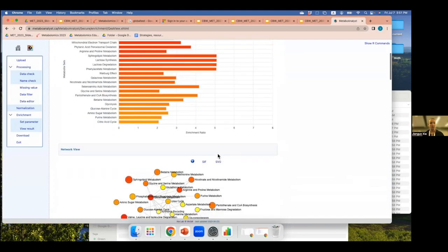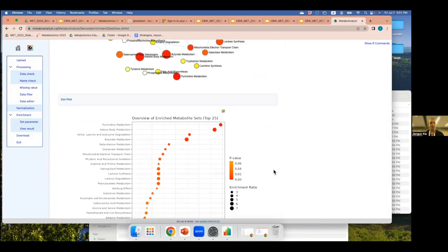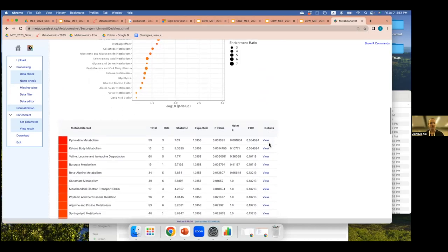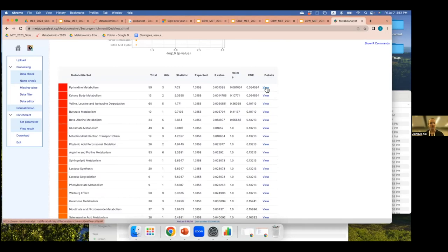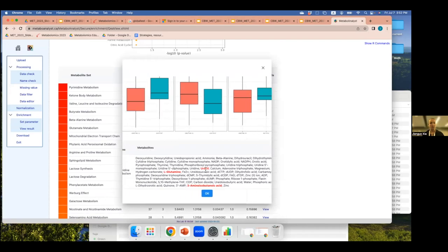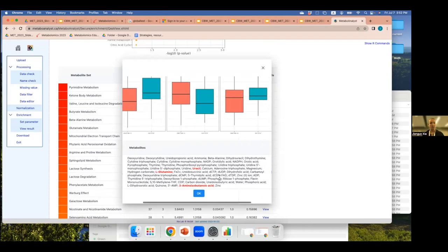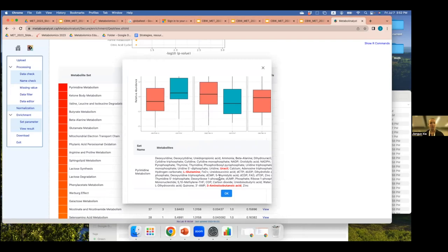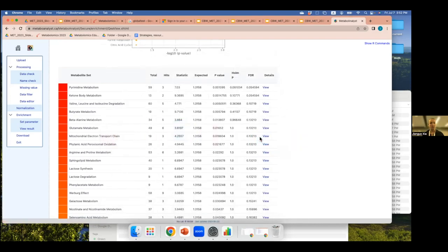Here are some of the plots you can get — there's a lot here, and there's help tips and protocol information for all of them. One important thing to highlight is the details view, which shows the list of all metabolites in a pathway with the ones in your dataset shown in red. This gives you a sense of how much coverage your targeted panel had. If a pathway has 200 metabolites but you only have three or four, you should take that into consideration when interpreting significant results — it's less of a concern with a larger dataset.